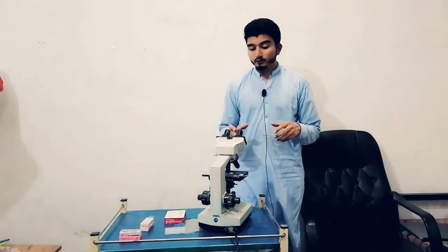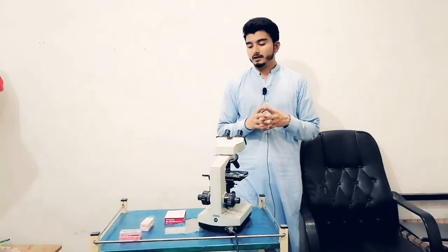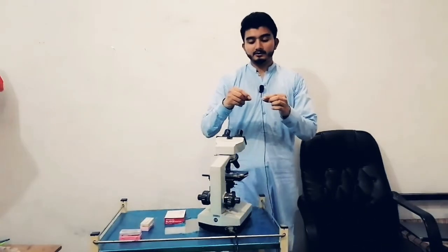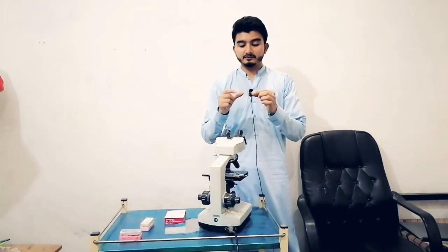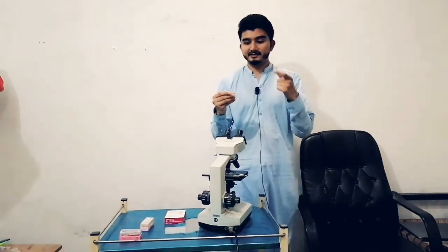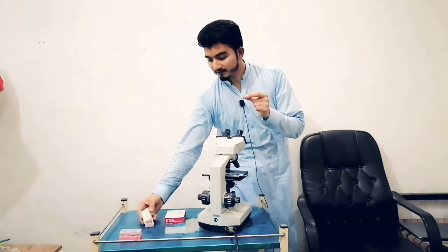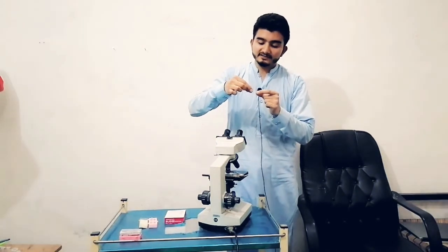For example, if you wish to take an overview of a urine sample, how is it possible? First of all, you should make a sediment. How is the sediment possible? With the centrifuge. You should take the sample in a tube, and you should centrifuge that urine for 5 minutes. Then you should take the sediment on a slide. You should take the part that settles at the bottom of the tube, that is called sediment, and take a drop of that sediment on this slide, and then take the cover slip. If I put down the urine sample sediment here on the slide, then I will put this cover slip on it.